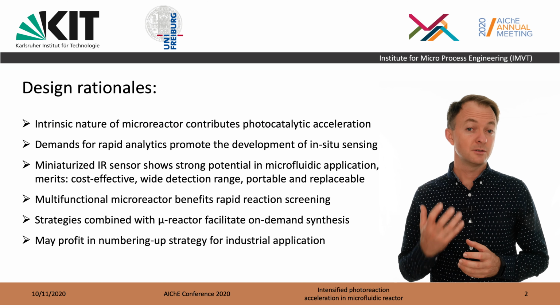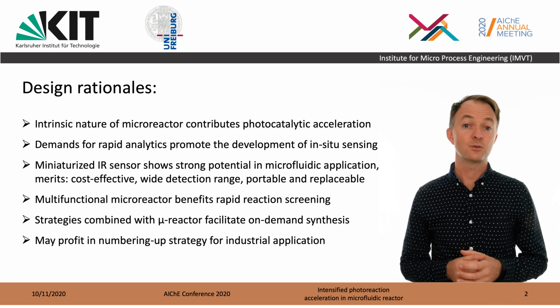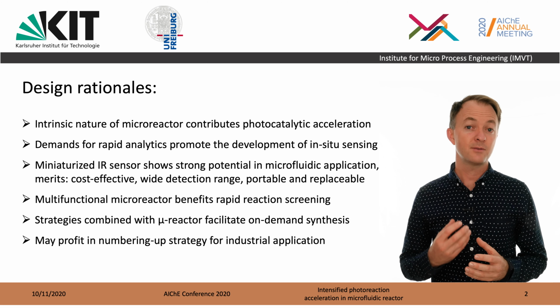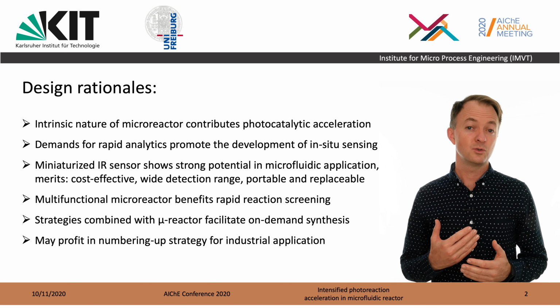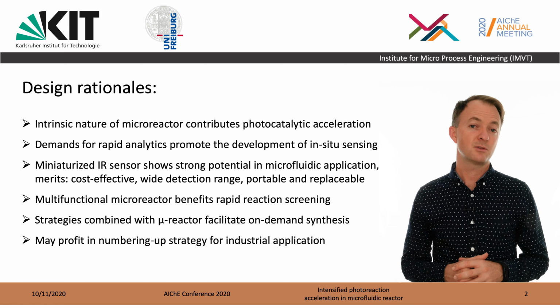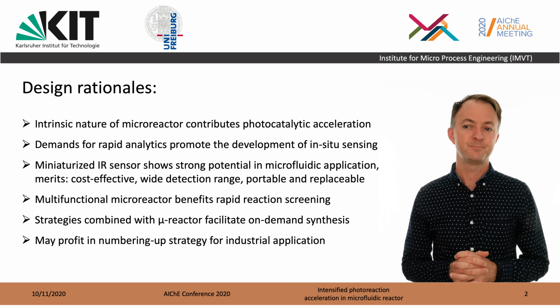Our rationale in designing and making this photoreactor is to take advantage of the intrinsic benefits of microreactors for photocatalytic reactions. That is partly from having excellent control over the reaction, knowing exactly the residence time distribution, but also the ability to control, for example, the local temperature, the concentration, the penetration depth of light, and other factors like that that allow us to very carefully control a photochemical reaction.